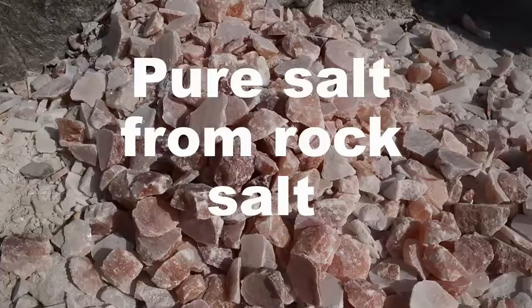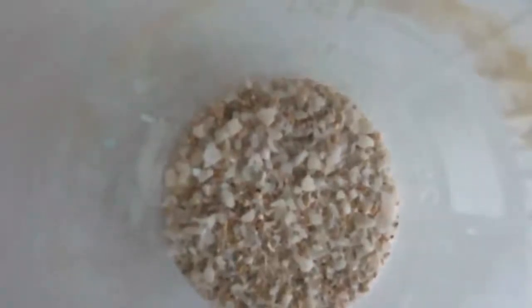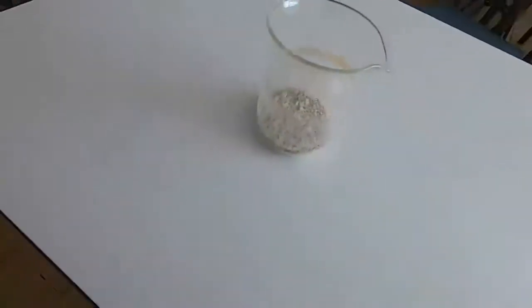In this experiment we're going to try to obtain pure salt from rock salt. Here's our sample of rock salt. You'll see it looks a little bit sandy and we're going to first of all dissolve that in water, so we're going to add some water to it.